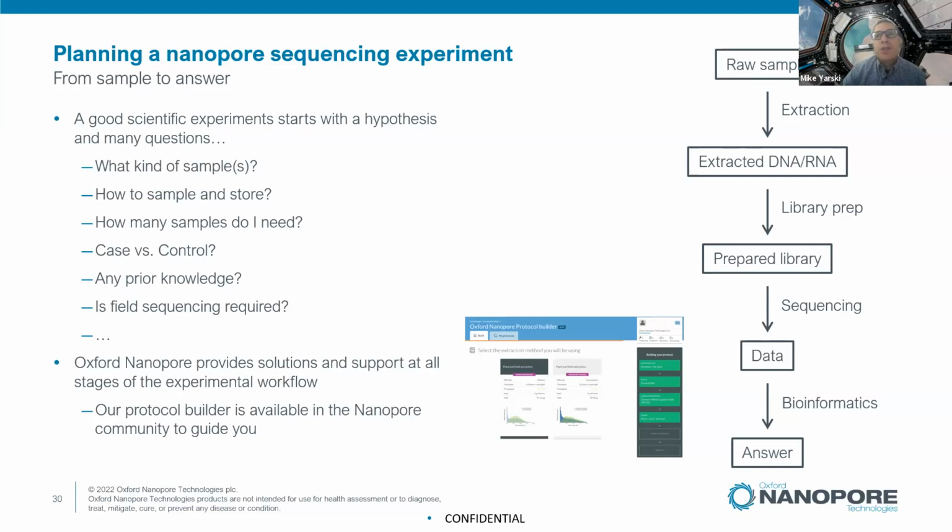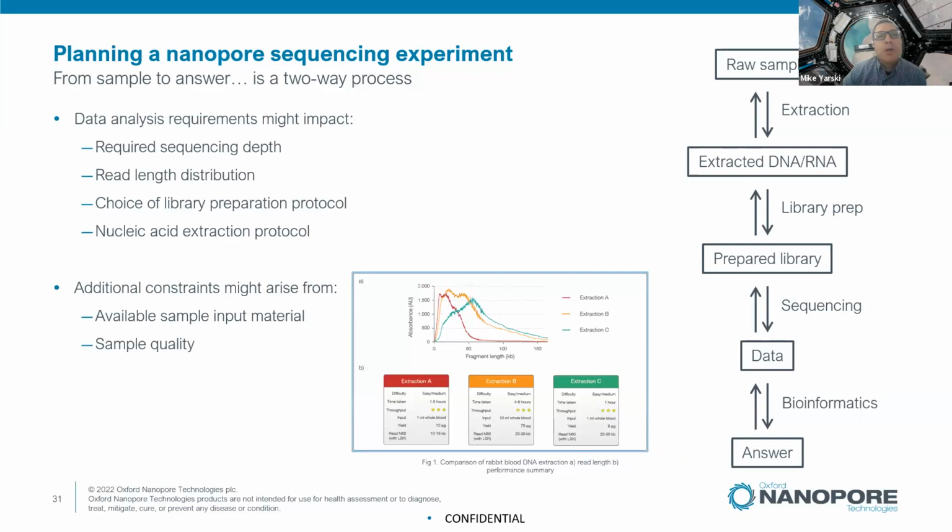But it's not just extract your DNA, library prep, sequence, data, bioinformatics. With Nanopore, you want to work back to front as well. Because if you can see on the center of this slide here, you can see clearly that the extraction kits directly affect the fragment length.